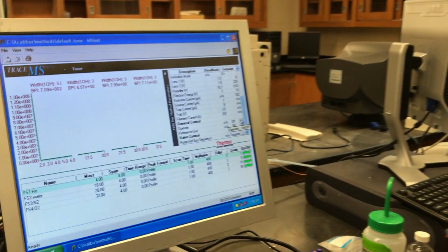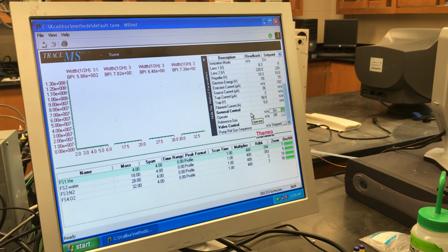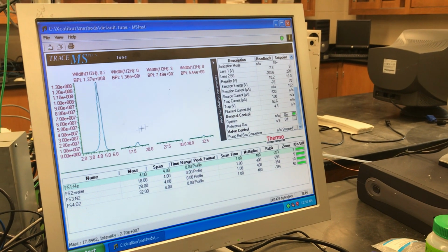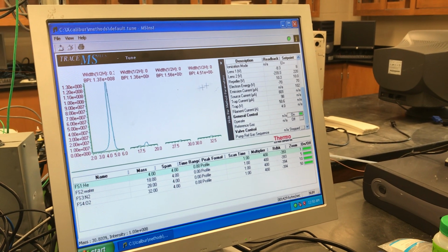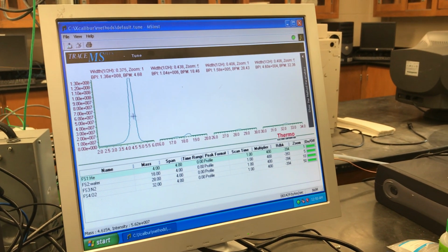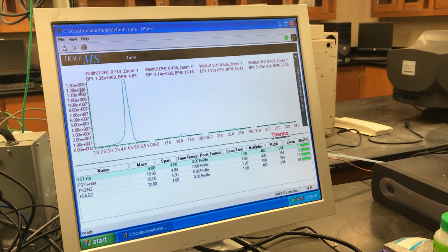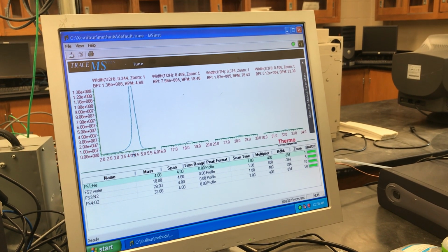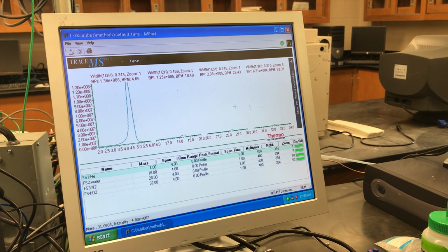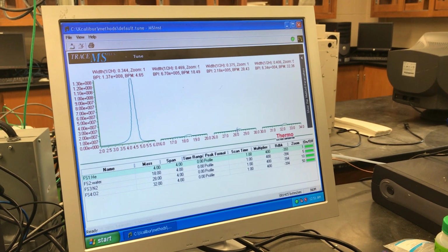So we're going to do a left mouse click here to turn the ion source on at this point. The electron gun is happening, and we're going to look across here to our readouts. What we're seeing here, and I'll just make this a little bigger so we can really focus in on it, is that we have a very large helium peak. What we're looking at is the total ion count on the y-axis as a function of AMUs on the x-axis, or masses.